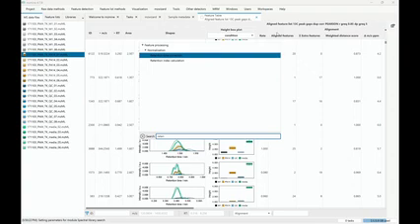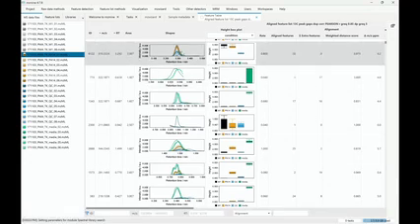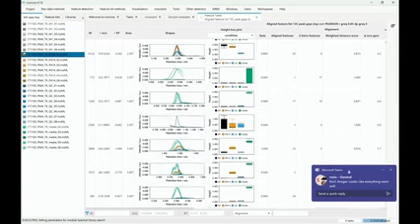This is only done on the feature level, so it's correcting the retention times of, let's say, batches in your different features. But then we also want to do that on the raw data level, because if you visualize raw data and the features should be at minute 9, but actually it's shifted, it's not going to look so nice, and it's going to be hard to review. And then we have QC filters and those kind of things already in the feature list rows filter, which is a good one for filtering.